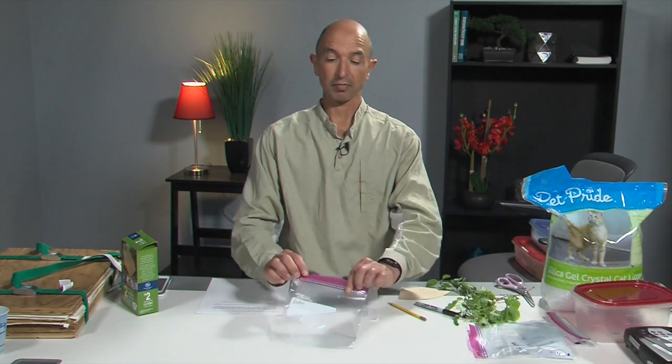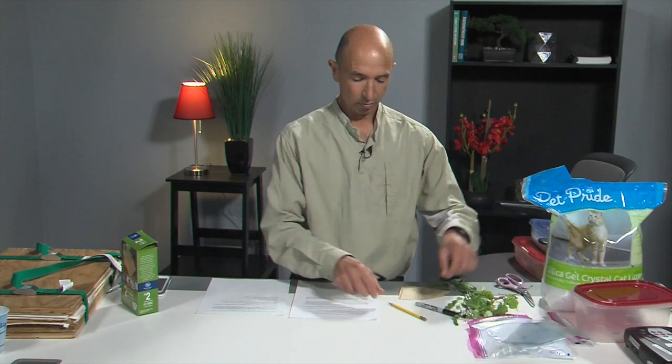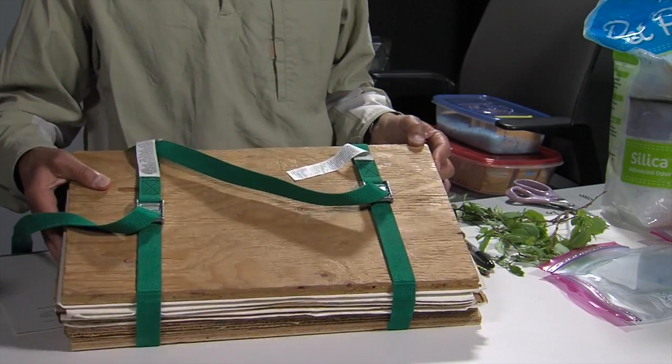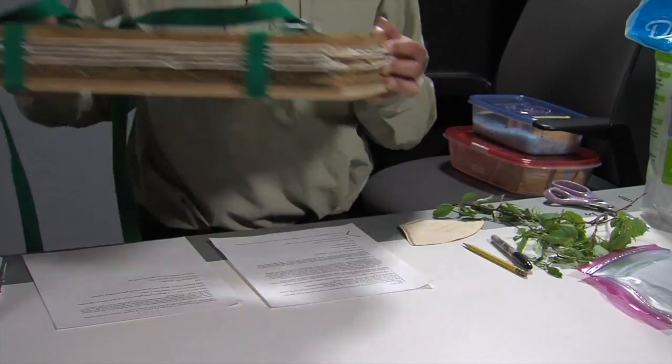You need Ziploc bags or some other plastic bag that can be sealed. You need a pencil, a permanent marker pen, and you need a sealable plastic box, and you also need a GPS device for georeferencing. In most or many cases, a mobile phone will work. And finally, do not forget your plant press to take your voucher specimens.